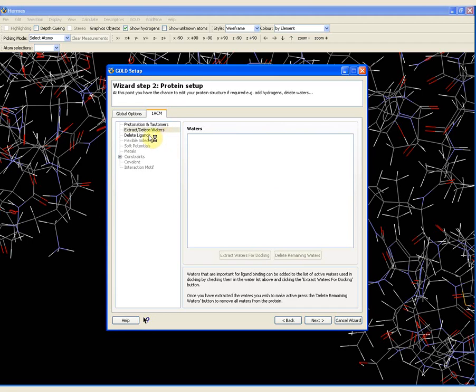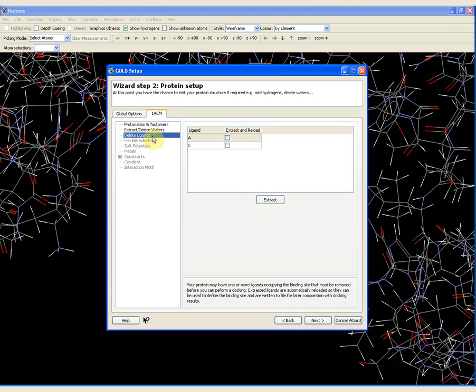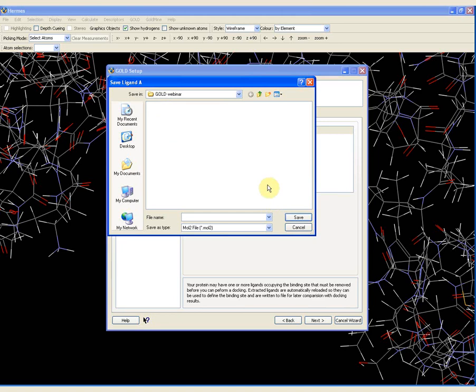Then I need to deal with the ligand using the delete ligand option. The reason we need to delete the ligand is because this is a protein-ligand complex, and therefore we need to delete the ligand from the binding site; otherwise GOLD will not be able to dock a ligand in the binding site because the binding site is not free. The ligand I am going to extract and reload is Ligand A. I put a tick box in here, click extract, and it prompts me to save this ligand. I am going to save it as ligand1acm as a Mol2 file.